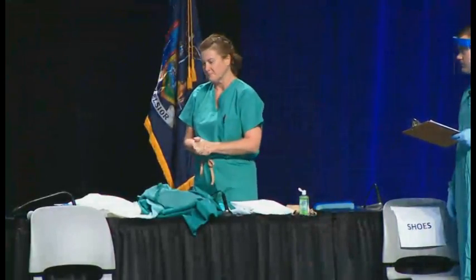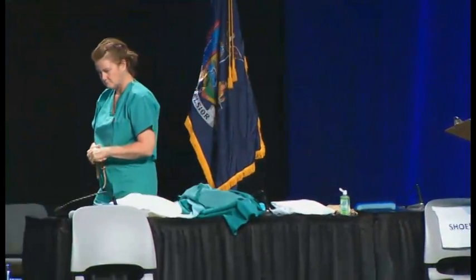As Brian just pointed out, we're demonstrating one of the two options that are recommended. Either option is recommended. Both of these options — the N95 respirator that we're going to demonstrate here, as well as the powered air purifying respirator — have been used successfully to safely care for patients with Ebola. Either option is acceptable. We are going to demonstrate the option with the N95 here.